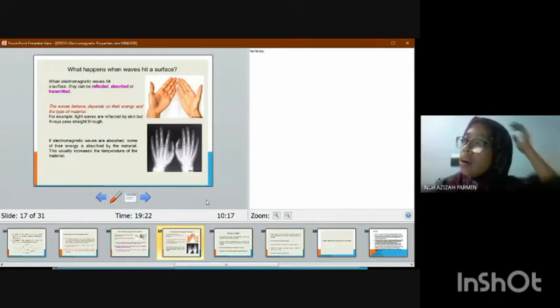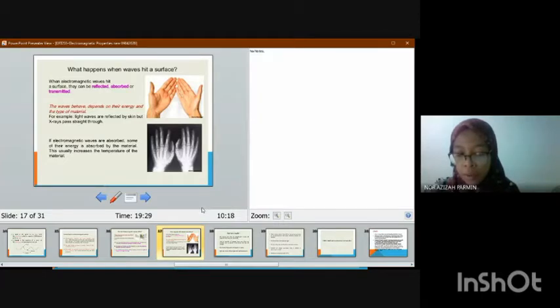Okay, usually according to this one, you can refer to page 164 because we have two different instruments to check the color, either spectrophotometer and colorimeters. Usually, in my lab, I'm using UV visible spectrophotometer. Okay, that one because it covers from 200 nanometer until 700 nanometer. They include the UV light and also the visible light.